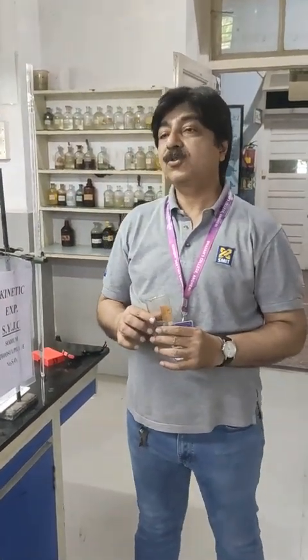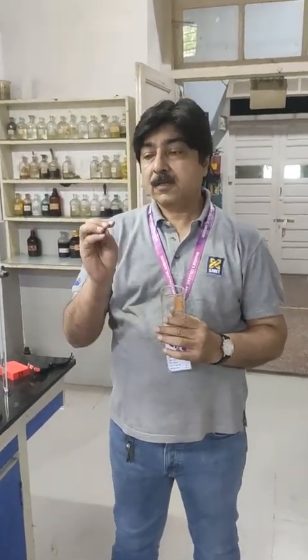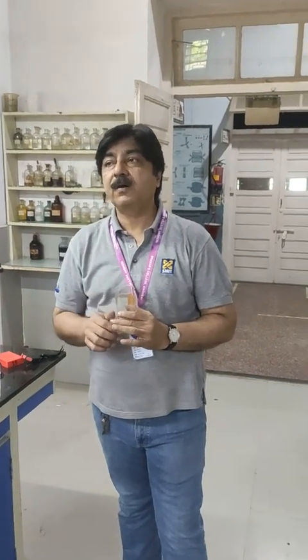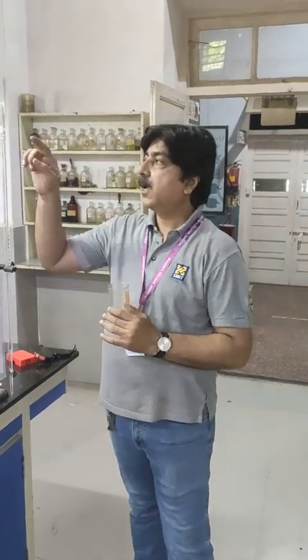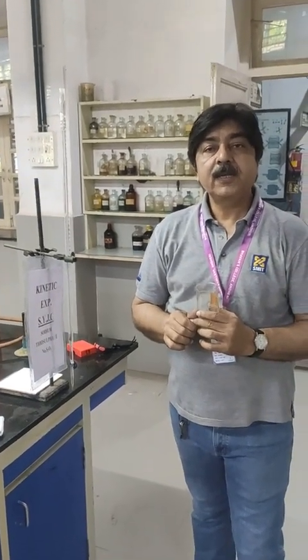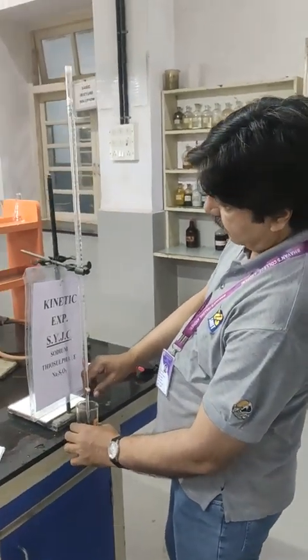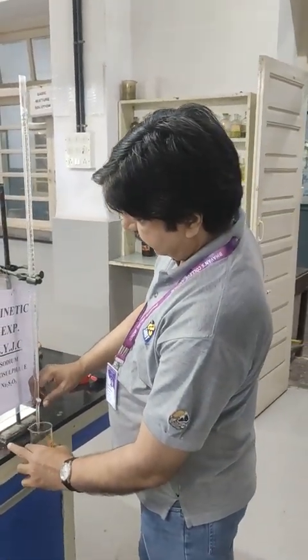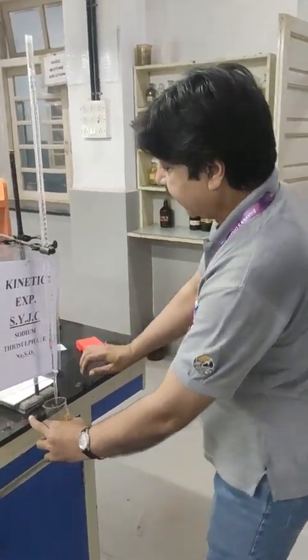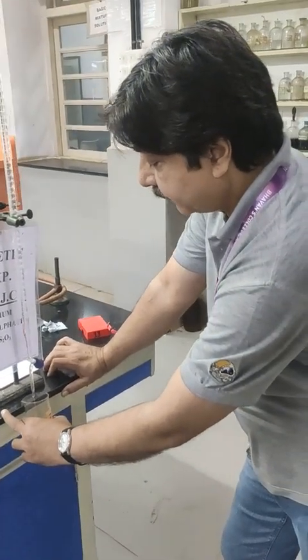Now friends, as per the textbook, 50 ml has to be taken, but I suppose there must be some query in this. Since the total volume has to be 50 ml and since we are taking 2 ml of HCl, the amount of sodium thiosulfate which would have been taken should be 48 ml. So I am taking 48 ml of sodium thiosulfate.